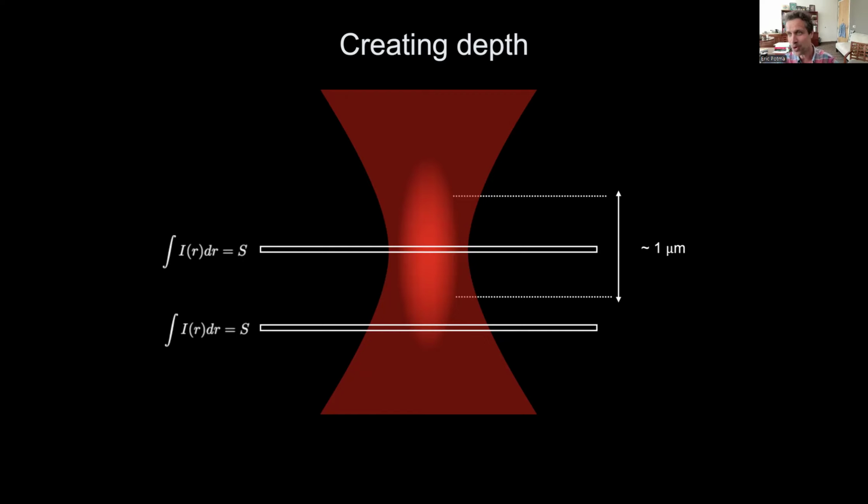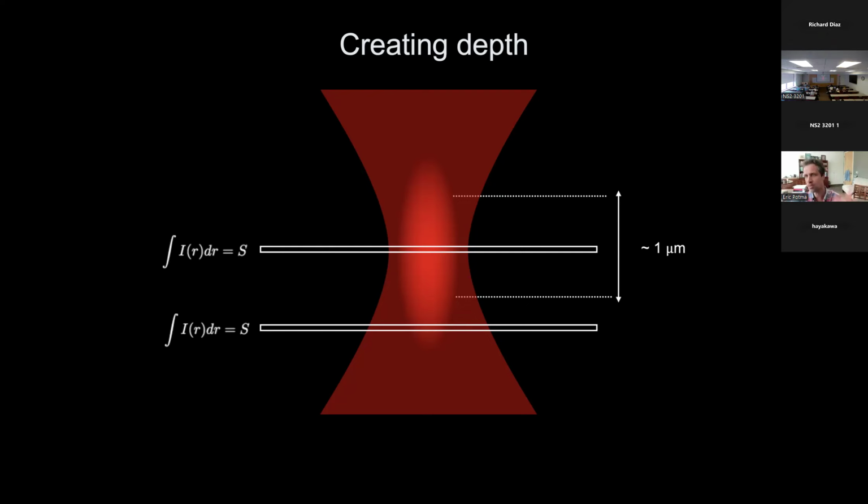That's very important because if you do regular microscopy, the fact that you waver out a little bit, the same number of photons still has to travel through such a plane, and therefore the molecules in those planes are still being excited, and they can still contribute to light.